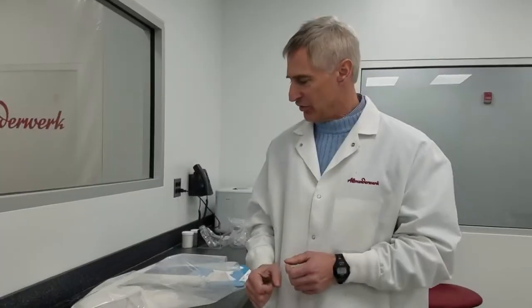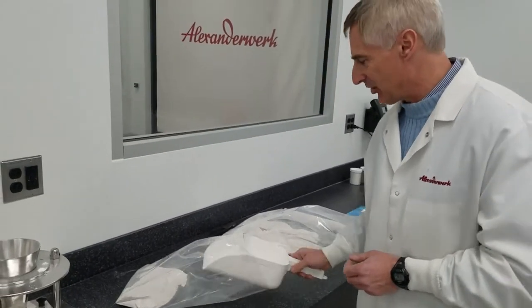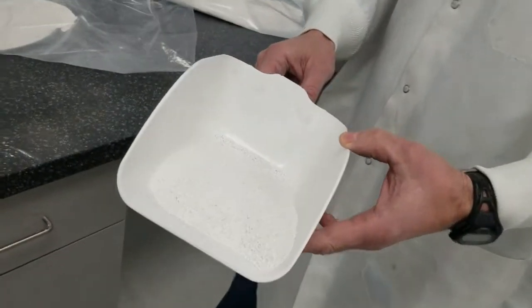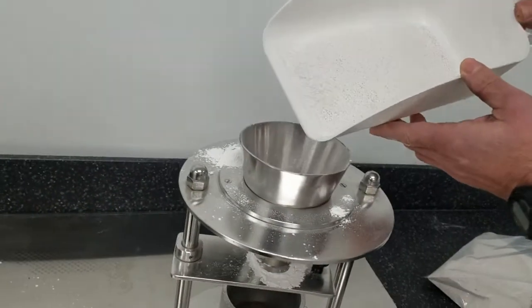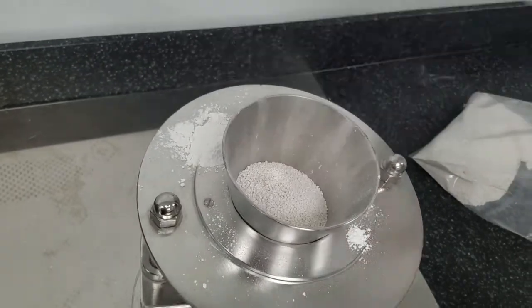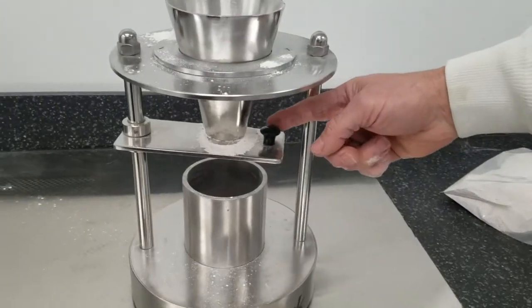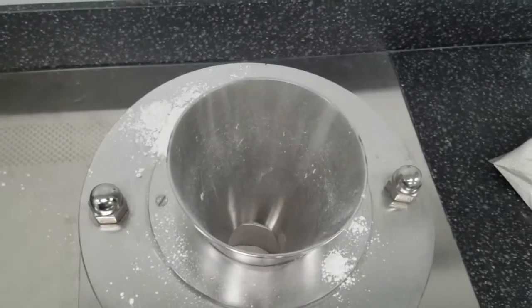As a final demonstration, I'm going to take some of the material which we compressed into what we call a granulate. This granulate is now in my shovel, and I'm going to pour this material into the feed hopper. You can see already these are nice granules that flow really well. This is the identical feed hopper, same angle, same setup as before. Now when I open the discharge valve, the material flows out very quickly and it's dust-free.